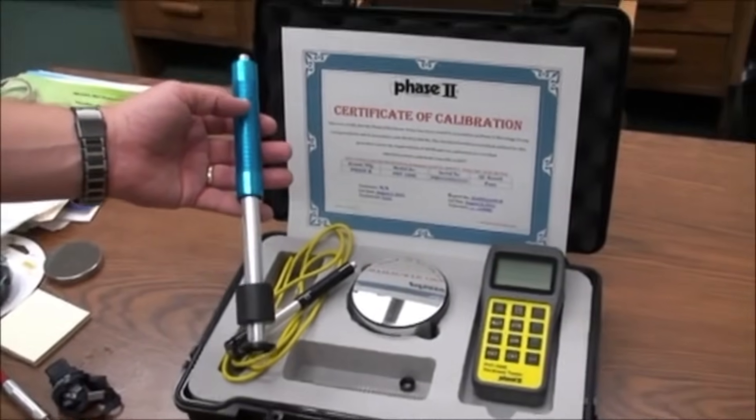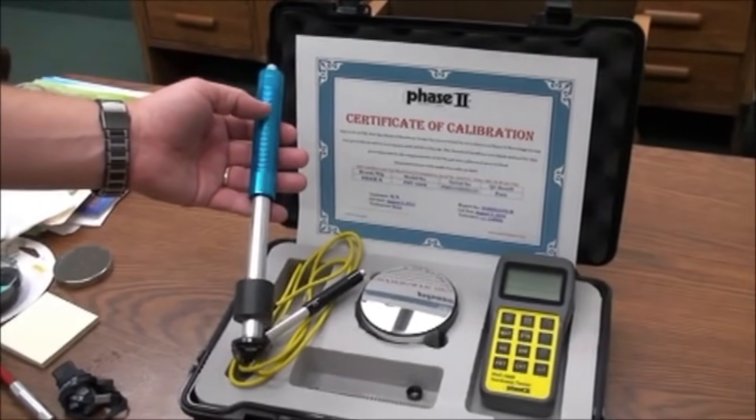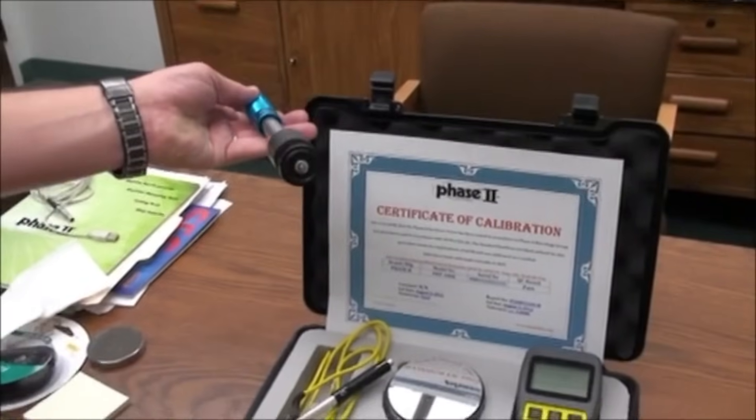The D-15 probe has a narrow contact area for use in grooves or recessed areas. The G-Probe is designed to test large rough castings. It utilizes a 5mm ball while all the other probes utilize 3mm ball.